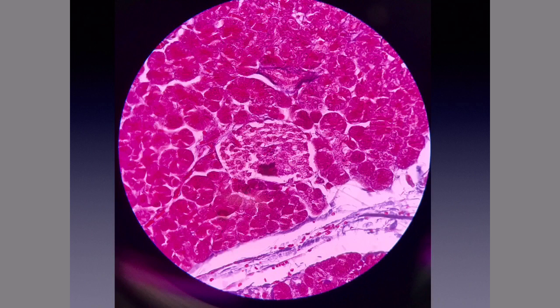Here we're looking at slide number three, and the specific structure that was labeled is here. Unfortunately, the crosshairs are not showing up real well on this particular picture, but as you guys saw during the exam, the crosshairs were centered on this structure here.